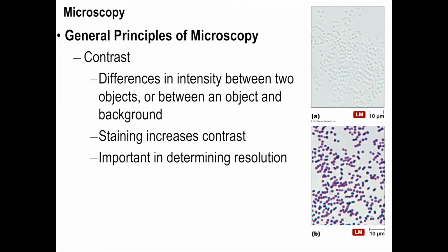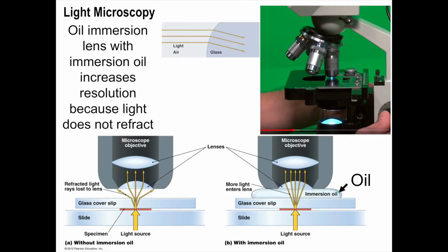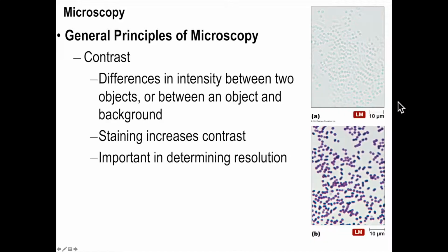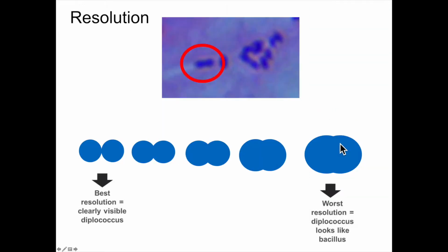So that was increasing resolution. And resolution is the ability to differentiate between two objects. That's one example. Contrast, as I talked about in another video, is the ability to see something compared to its background, right? And we all know what contrast is. You may change contrast in an image if you're making it look better. So we all understand that we're going for a kind of punchy, wow, I really see that now, whereas before it was kind of all blending in. And so the blending in is like up here, and that's down here. And so this is important for resolution as well.